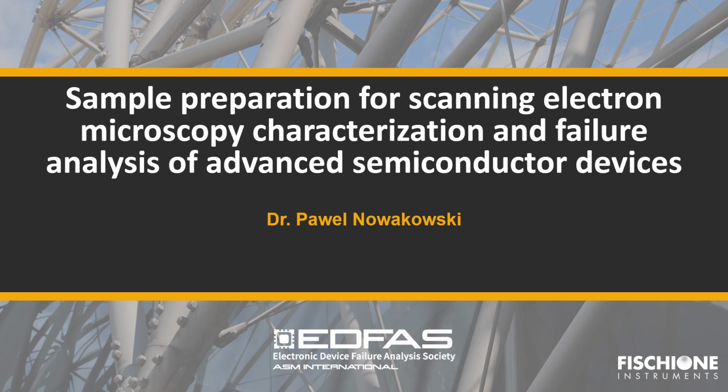Today we will discuss sample preparation techniques for scanning electron microscopy characterizations and failure analysis of advanced semiconductor devices.